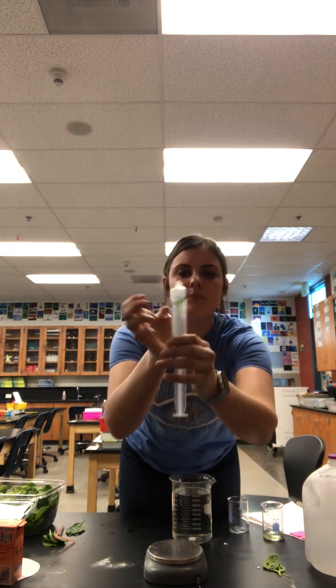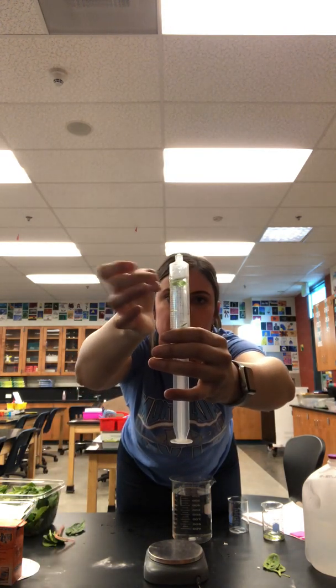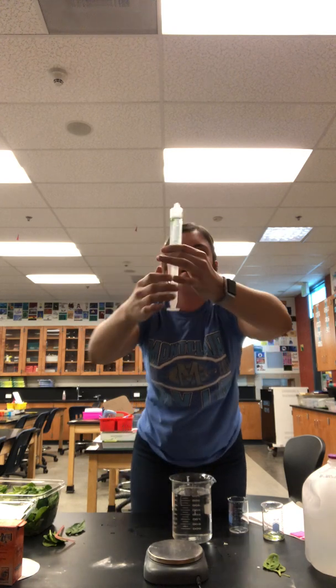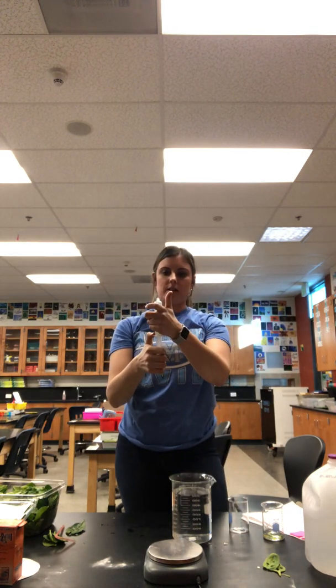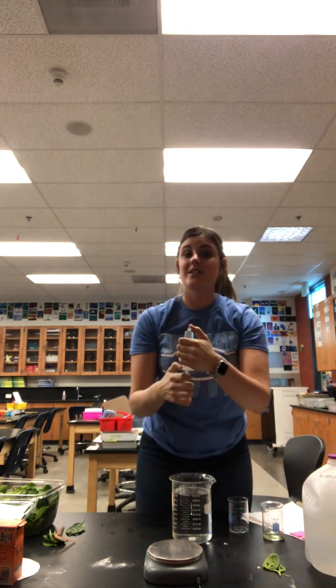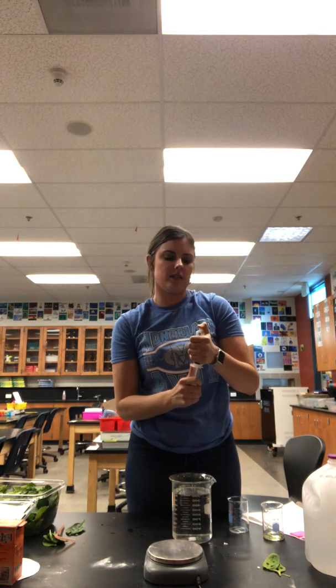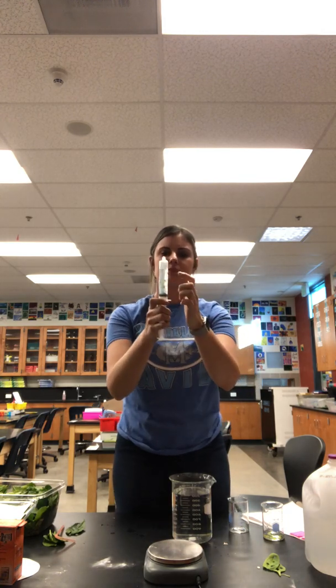Once we let go, our chads should start to sink. We got a couple floaters. Some of them are a little stubborn, so you might have to do this a couple times to get all of them to sink. And if there are some that you can't get to sink, we'll just pull those out of the experiment and not include them in our data.